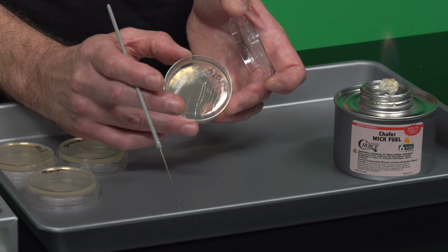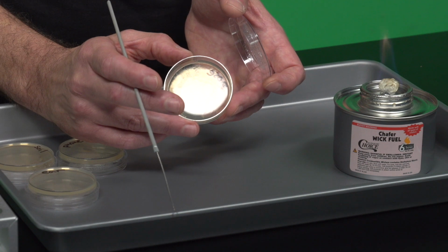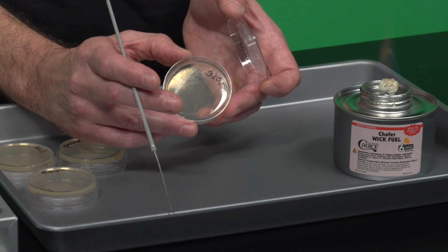If we look at this, it's hard to see here, but if you were to look at yours, or there we go, you see the streaks? We can see the streak marks right there. Basically, we're carving a little bit of the media, but not so hard that it breaks, but you can see those streak marks.